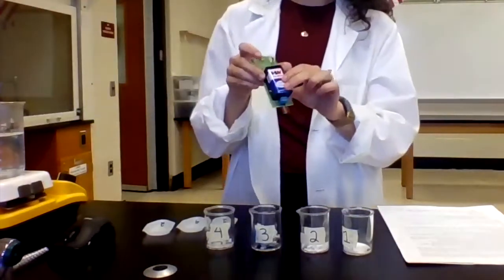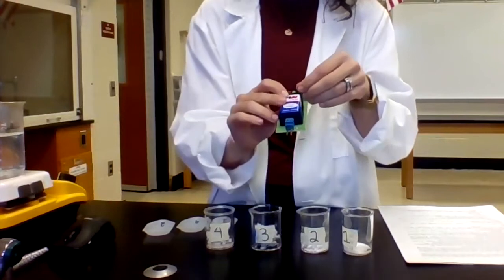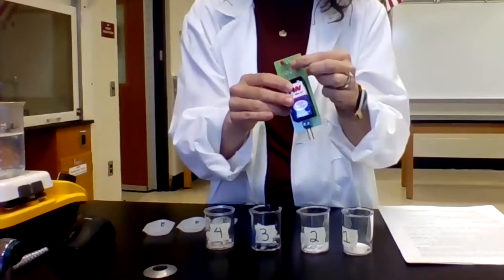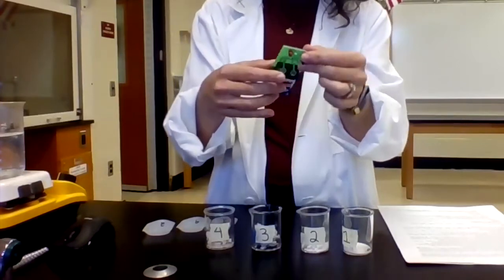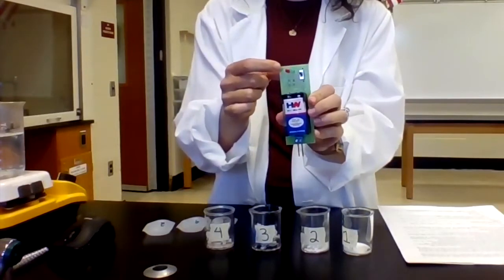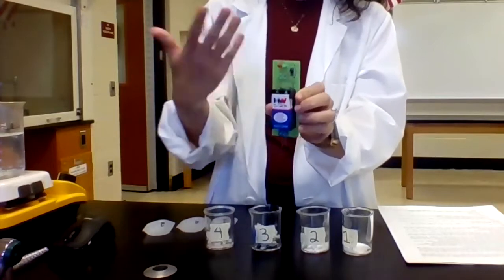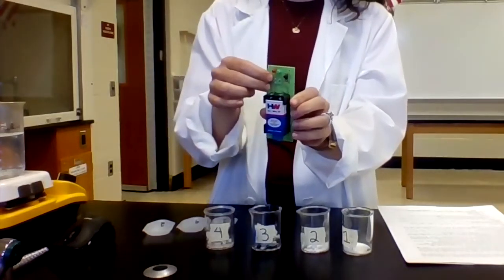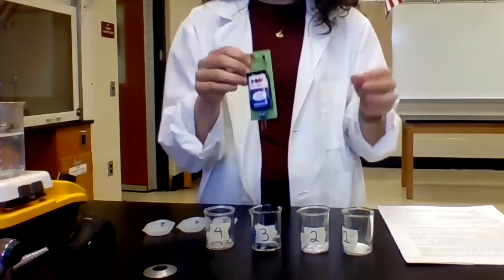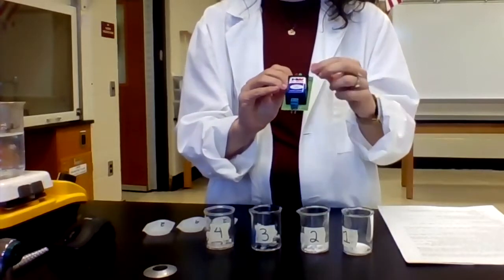What I'm going to use here to test the conductivity of a solid is this conductivity tester. You can see it has the electrodes here at the bottom and just a simple on-off switch. There are instructions on the back. There are 2 lights here, a red light and a green light. Whether one light or both lights light up will tell you if it's able to conduct a little bit or if it's a good conductor. So we need to be able to put this against each of those solids.